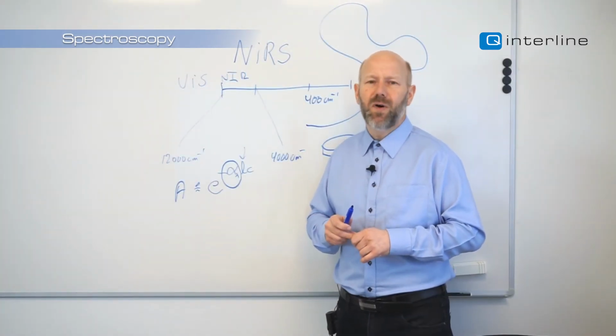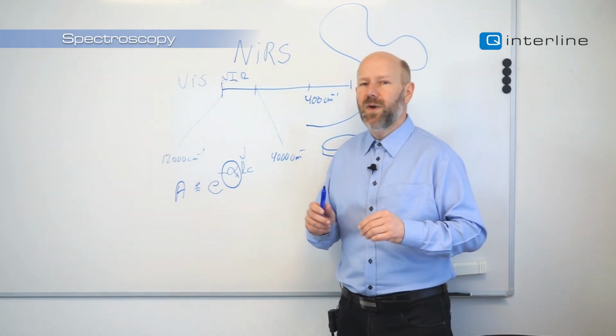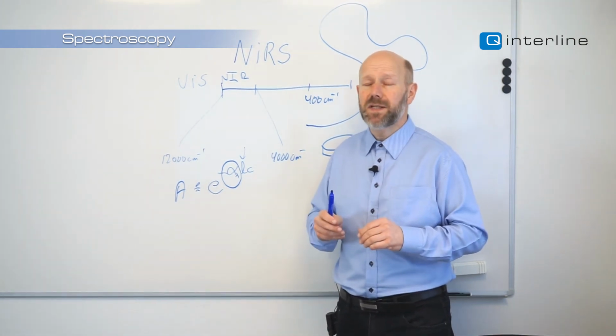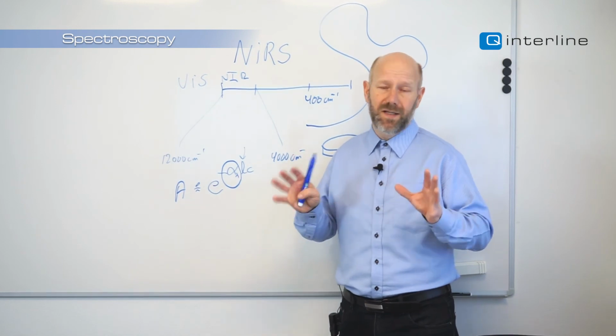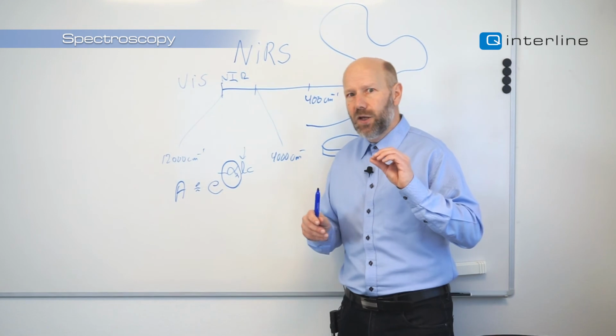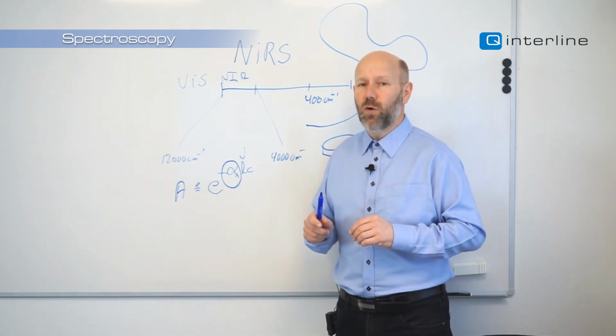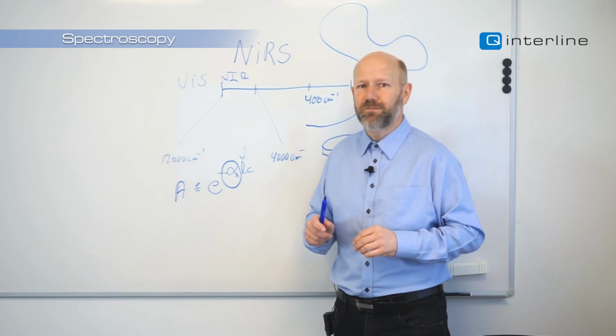We cannot resolve them optically, so no reason to crank up your spectrometer trying to resolve what has been smeared out by physics and pressure and a number of molecules. We merely have to take a low noise look at small shoulders and we can get very, very robust readings of our molecules.